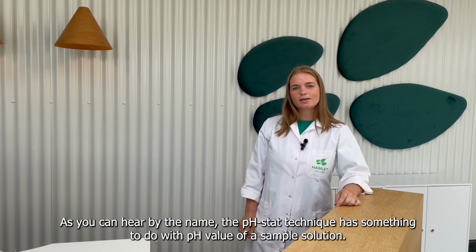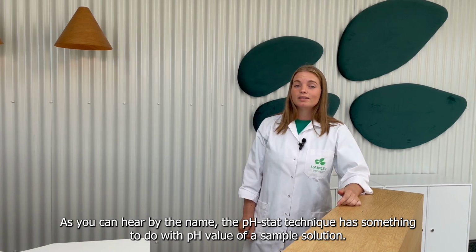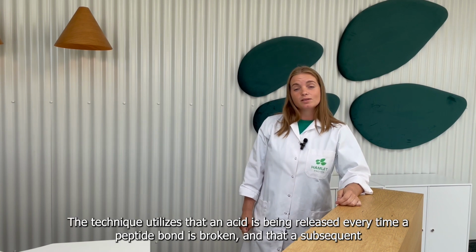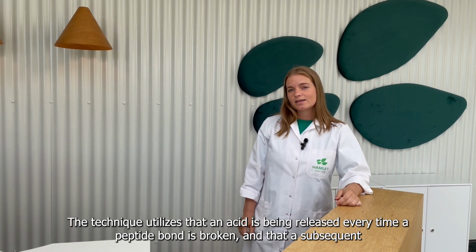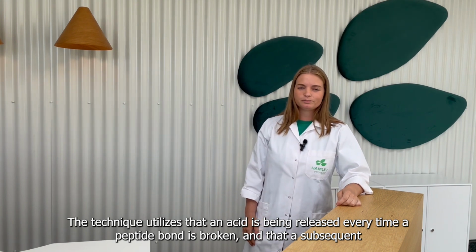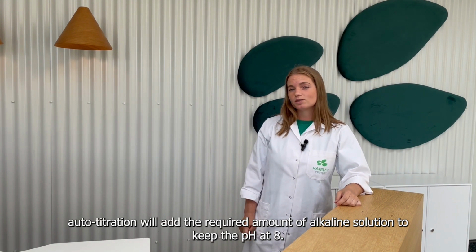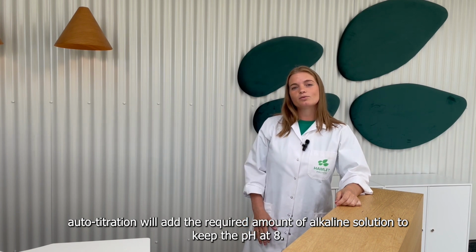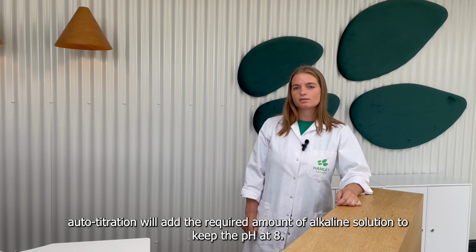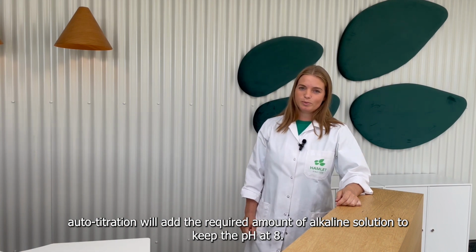As you can hear by the name, the pH-stat method has something to do with the pH value of a sample solution. This method utilizes that an acid is being released every time a peptide bond is hydrolyzed, and that auto-titration will automatically add the required amount of an alkaline solution to keep the pH value at 8 throughout the incubation period.